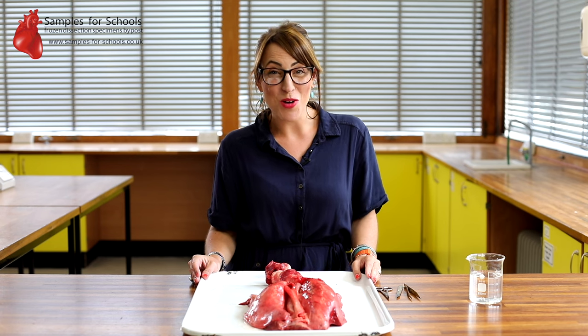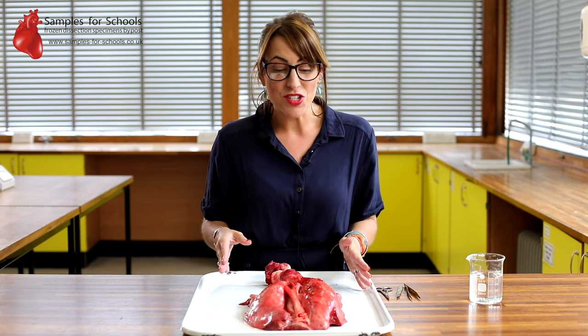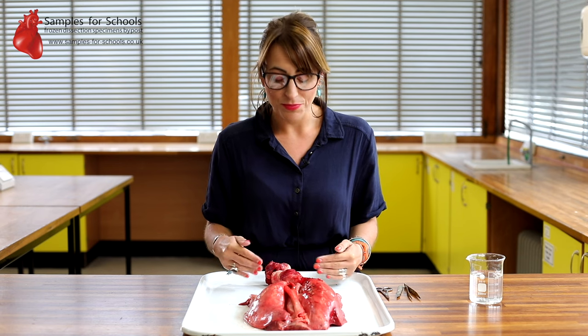Hello, and welcome to Samples for Schools Lung Dissection. In this dissection, we're going to be looking at a lung pluck. In your sample, you can have it with or without the liver and the heart attached as well. We're just going to do a simple run-through of the lung system today.